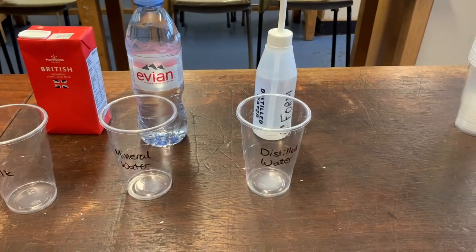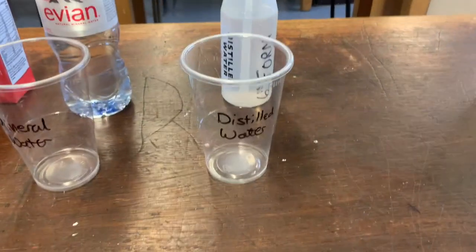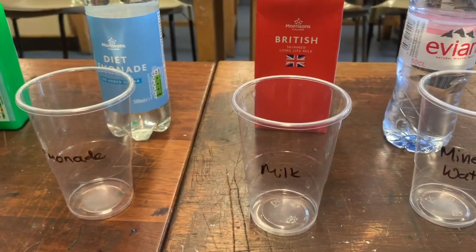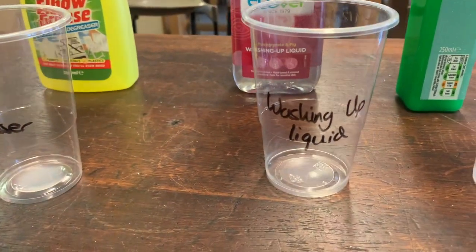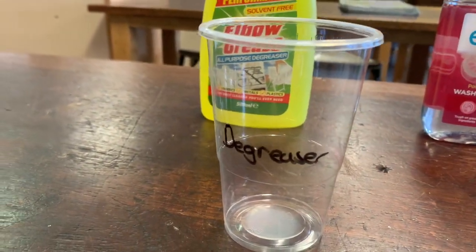You can see I've set my chemicals up here with a plastic cup that I've labelled. First we've got some distilled water, then some Evian mineral water, then we've got milk, then lemonade, lemon juice, washing up liquid, and finally a degreaser.